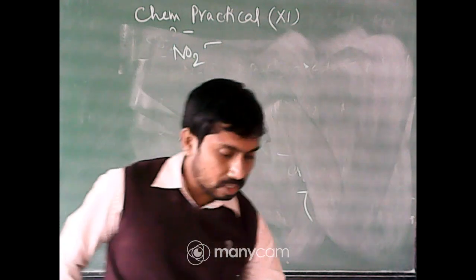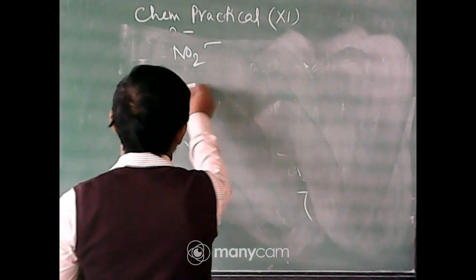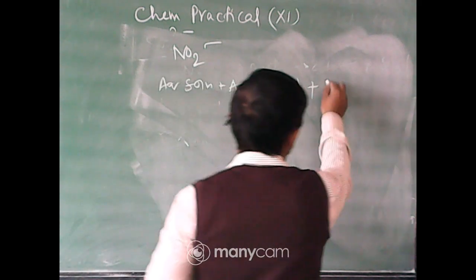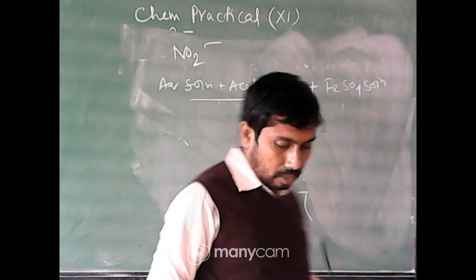For this we have to prepare the aqueous solution again, plus acetic acid, plus ferrous sulphate solution. So let's get ready for that.